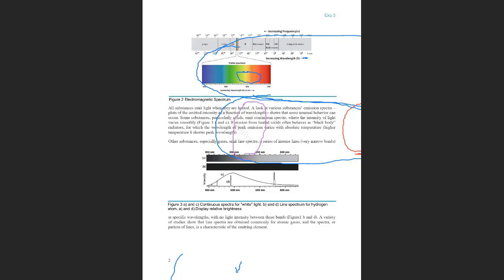And then you will calculate the energy of those lines. And in the last part of the report, you will look at the spectra of colored solutions, like a red dye, blue dye, green dye, and a yellow dye. And you will then record the wavelength of the peaks. And after that, you will be asked to conclude about the colors that your eyes perceive in relationship with the energy absorbed by the colored solutions.